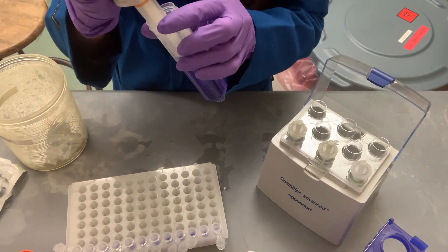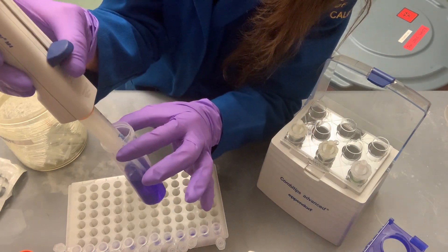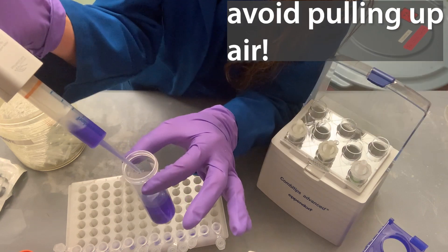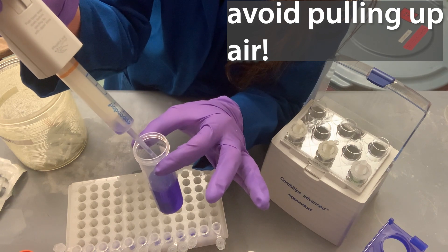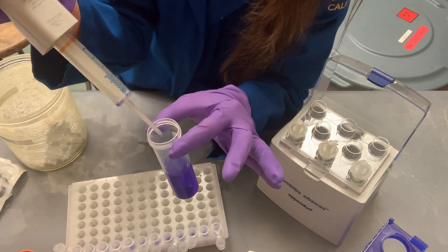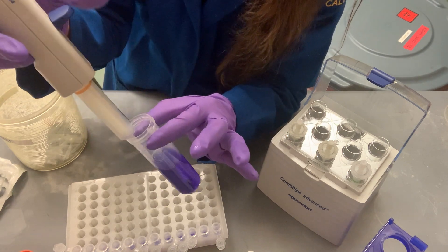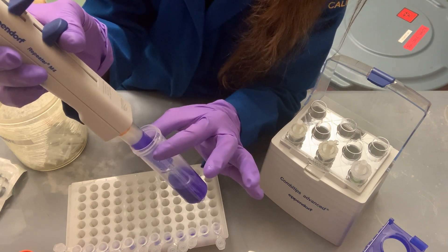Similarly, don't trust the last dispense either. If you refill and accidentally pull up a little air, the first and last aliquots can be off — air may start coming out at the end. To avoid this, don't aspirate all the way to the bottom of your tube; just go most of the way to avoid pulling up air.